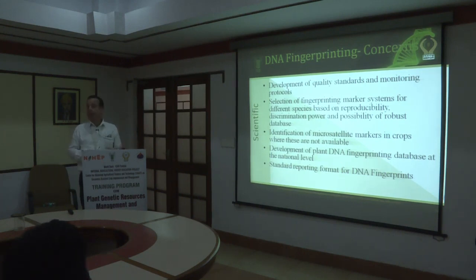Next, a standard reporting format for DNA fingerprints. Somebody is reporting fingerprints in their own way, somebody else is reporting in their own way. Do we have a unified standard protocol, a standard procedure, for how it has to be reported and how it has to be put in the database? So a standard reporting format has to be there.